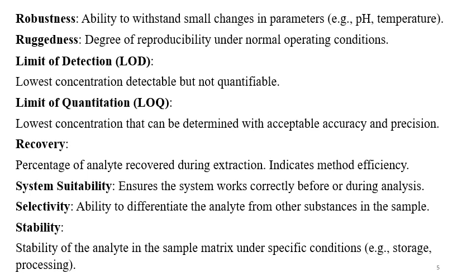Then comes the limit of quantitation, LOQ. It is the lowest concentration that can be determined with acceptable accuracy and precision. LOQ is a terminology which is very important to understand, and as per this definition, LOQ will always be more than the LOD, because the LOQ concentration will always be more than LOD.